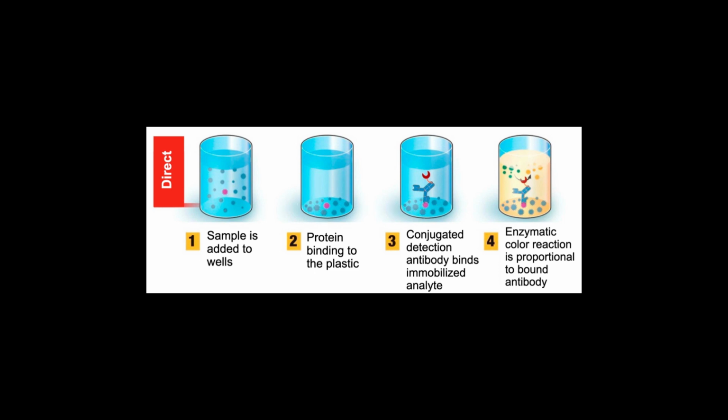To conduct the ELISA test, first coat the microtiter plate wells with a specific antigen or antibody. Then add a blocking solution to prevent nonspecific binding sites. Next, incubate to block for a defined period. Then dilute and apply samples containing the target molecule to the coated wells. Next, perform multiple washes with a washing buffer to remove unbound substances and add primary antibodies to the specific target.